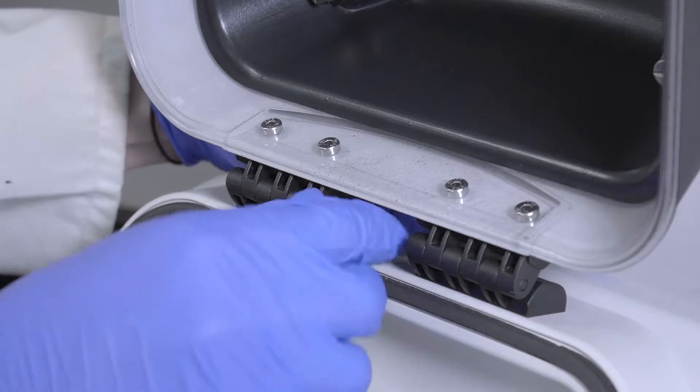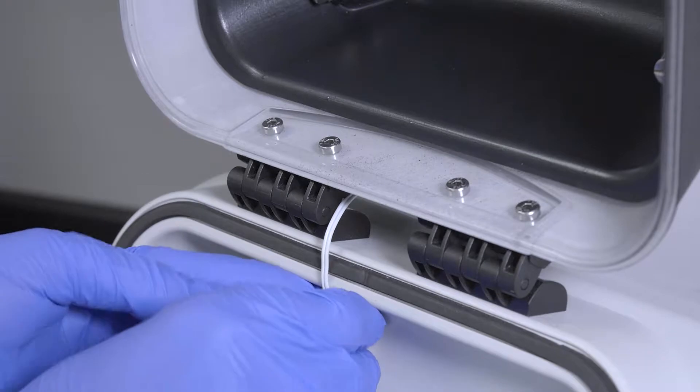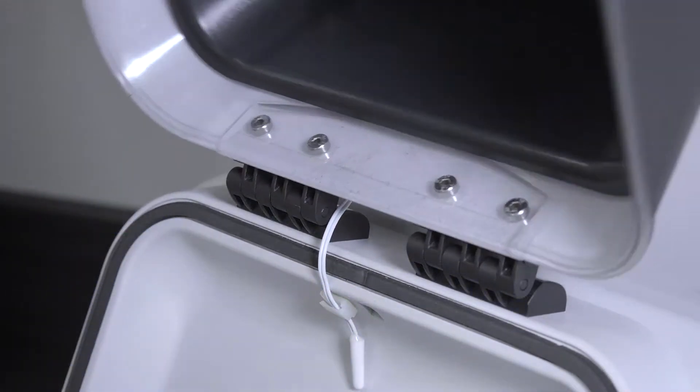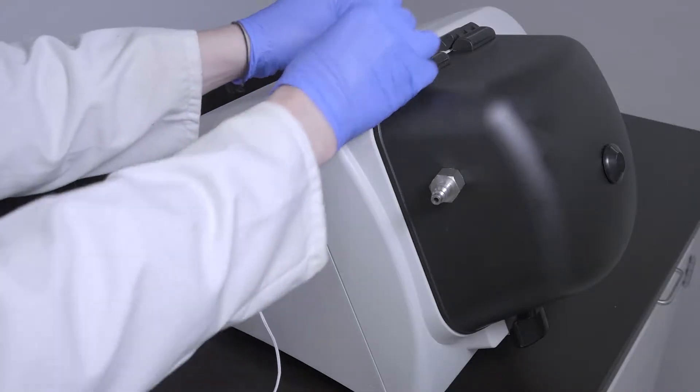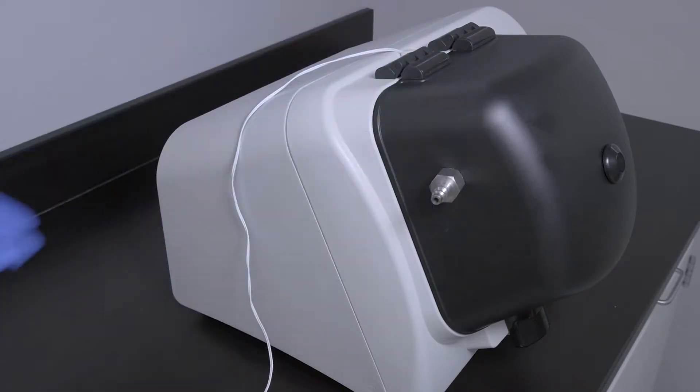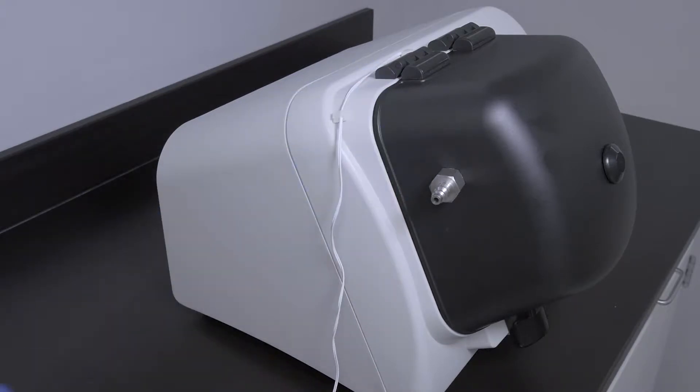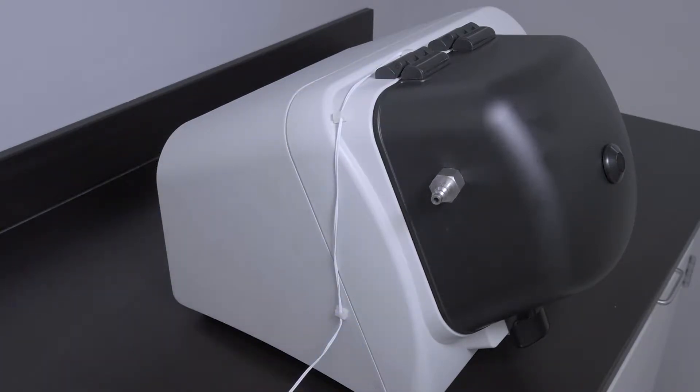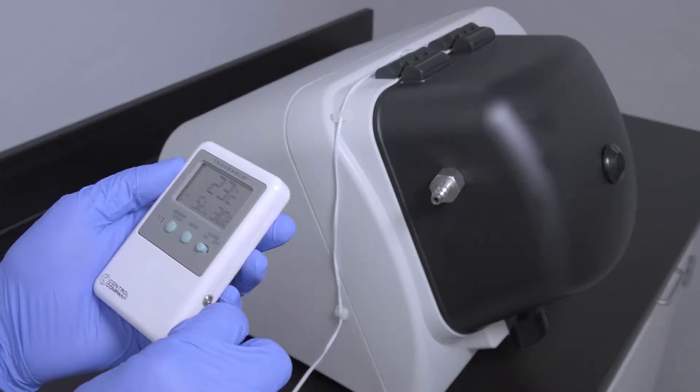Position the thermometer probe under the BeadRuptor lid and use a couple clip to secure the thermometer probe wire. Place the remaining couple clips along the top and side of the BeadRuptor, guiding the wire through the clips. Plug the wire into the external thermometer.